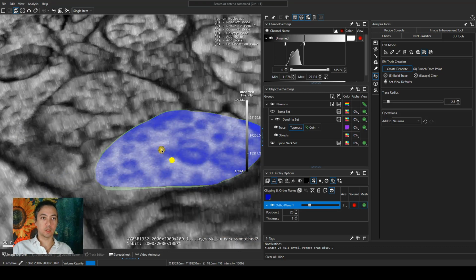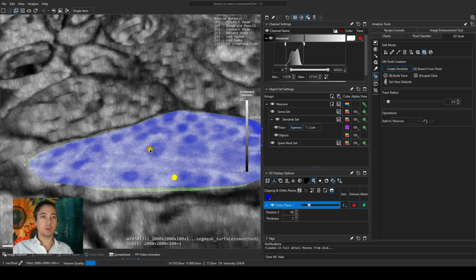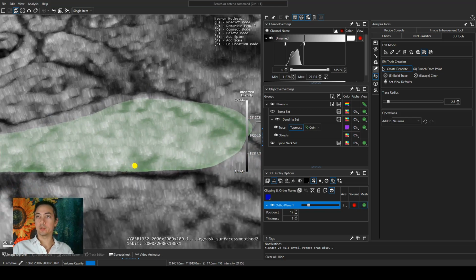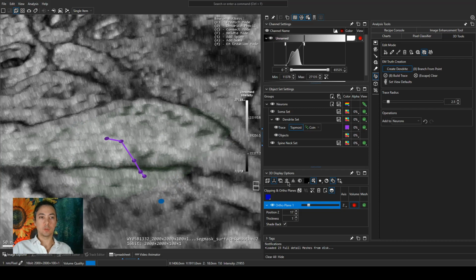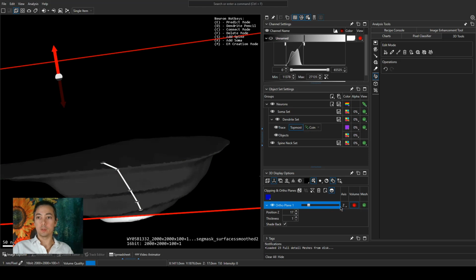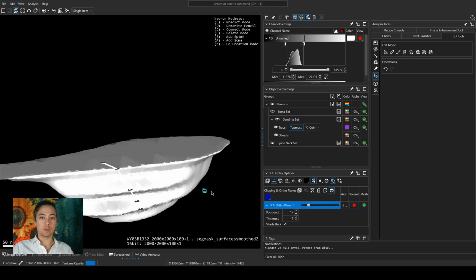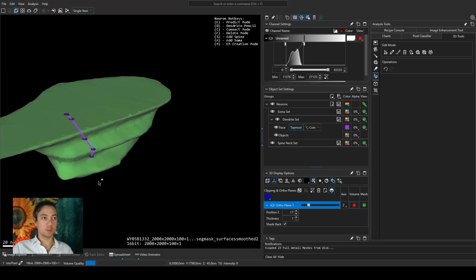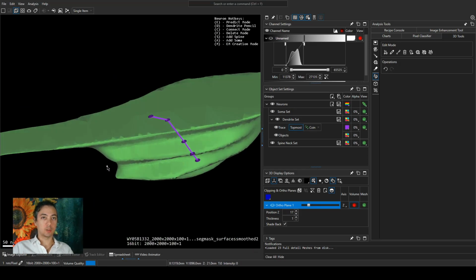Up is the other way, sorry. Up. I think that's the end of that one. Turn off this and this one. And there is, oh, you know, it might be good to go off to the side there.